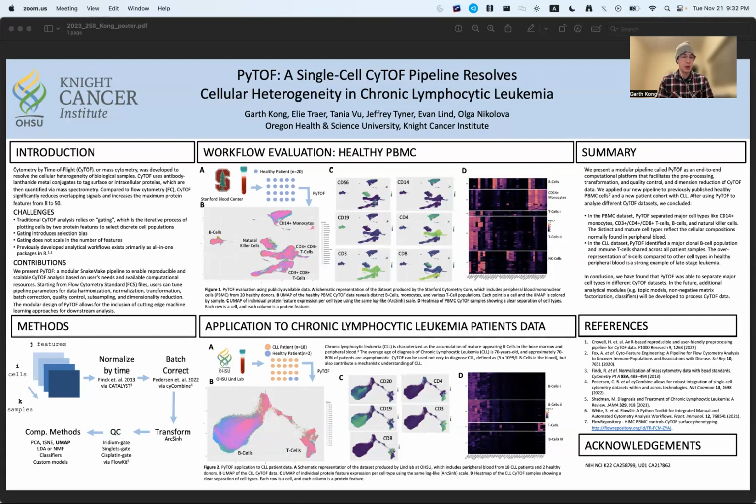And then lastly, we can use other computational methods to help really analyze the data and put meaning behind it. That means our dimension reduction techniques like PCA, t-SNE, and UMAP. Or if we want to look at more sophisticated models, we can use LDA or NMF.